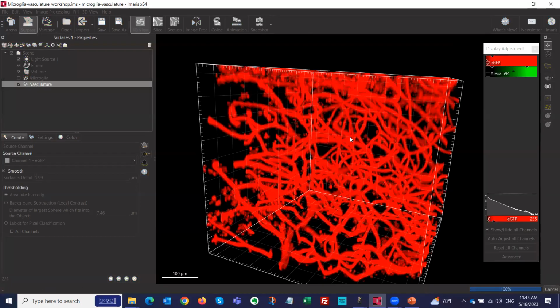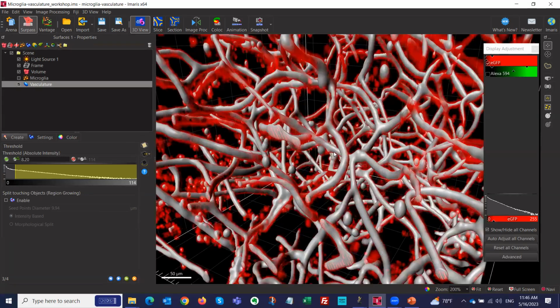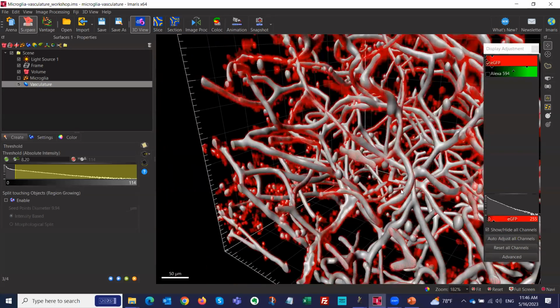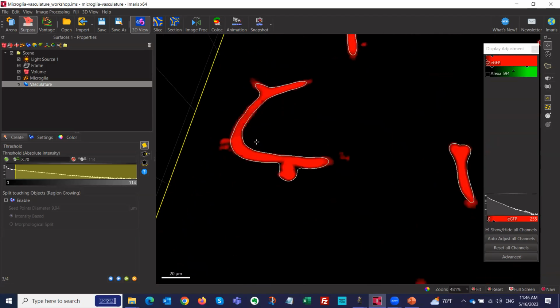So it creates the segmentation. This is what you can see. Yeah, it created segmentation, so we enter 3D mode. It looks pretty good, I would say. I mean, you can maybe see there's a little bit of under segmentation. If you zoom in, you can probably see it, but you get more information in detail if you go into the 2D mode. Here you can get a better idea.